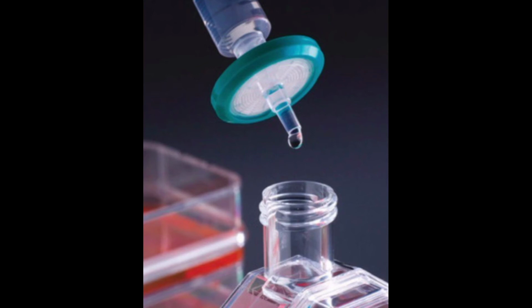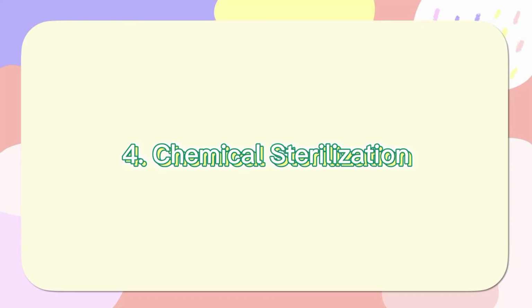Being relatively affordable, they may be used for general purpose filtration, especially of smaller volumes where losses by soaking up filter paper are significant. Syringe filters are also available for the filtration of gases and for the removal of bacteria from samples. Lastly is chemical sterilization.